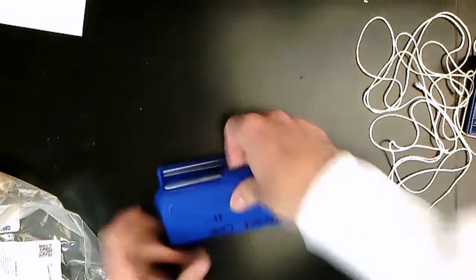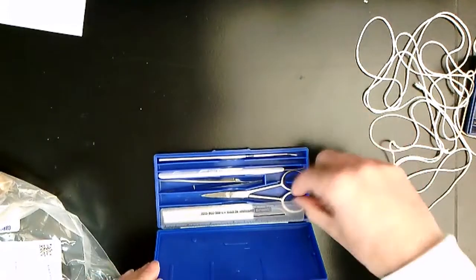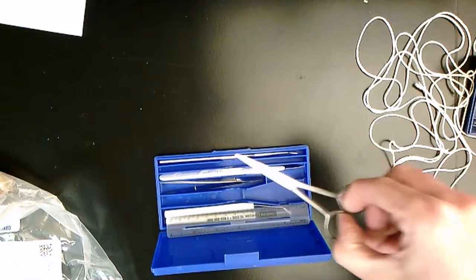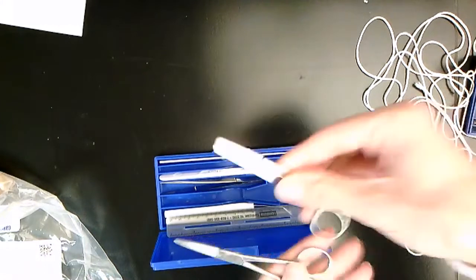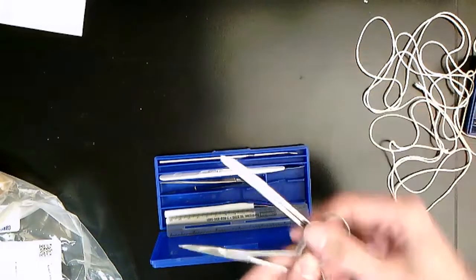So the first thing you're going to want to do with the fetal pig is take either the scissors out of your dissection kit. So this is the dissection kit that your students will be given at the event. It's just a basic kit with scissors and a scalpel. Some of the kits have scissors that have pointed blades, and some of the kits have scissors that have a point on one side and curved on the other.